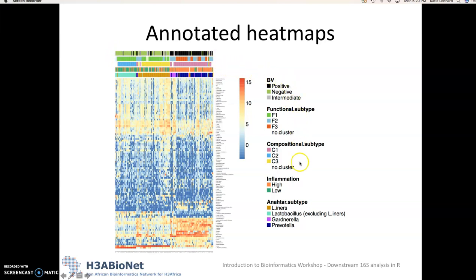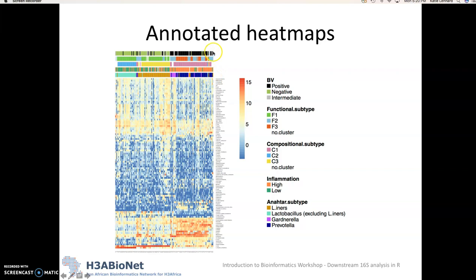So in this case we were able to spot specific patterns where if you perform unsupervised clustering, so here the columns have been clustered in an unsupervised manner and we can see that really these samples that are labeled as BV positive strongly clustered together and then that corresponds to specific taxa of interest.